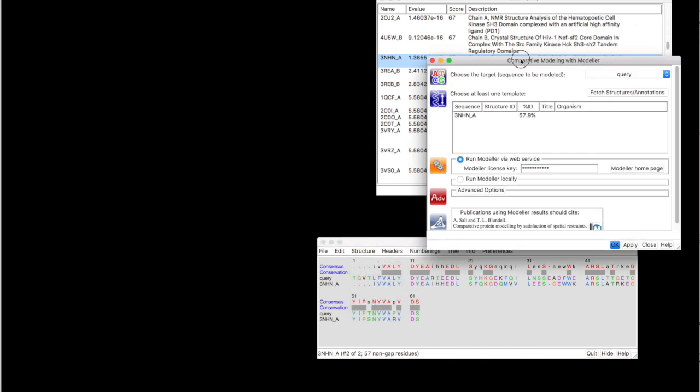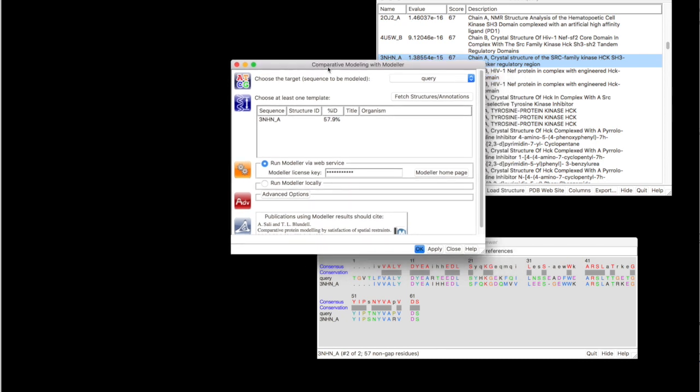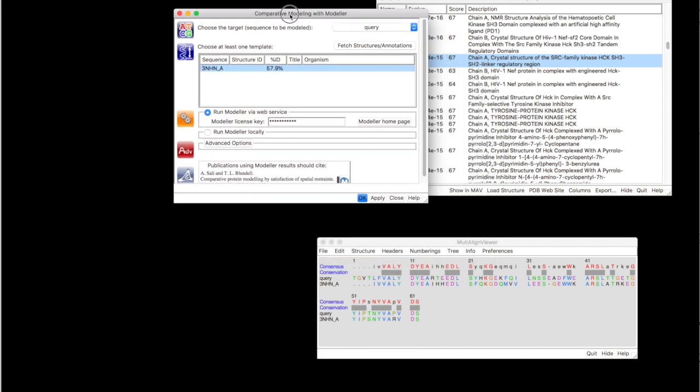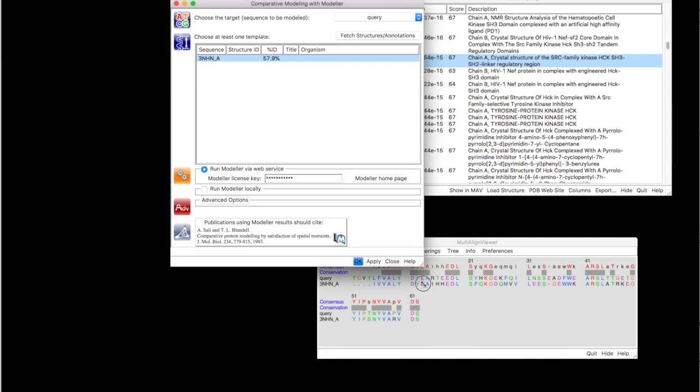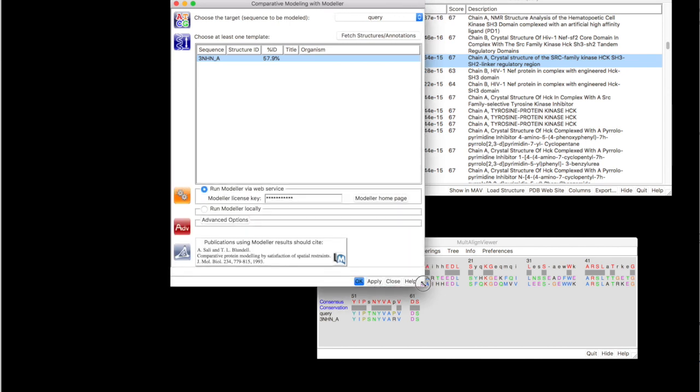And right now you can see in this panel that this model that I've chosen has 57% of sequence similarity. That's acceptable and it will work just fine.